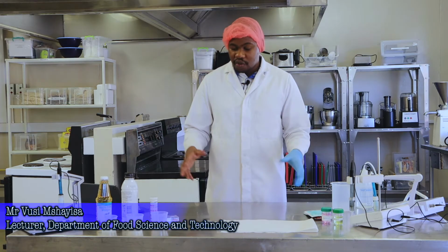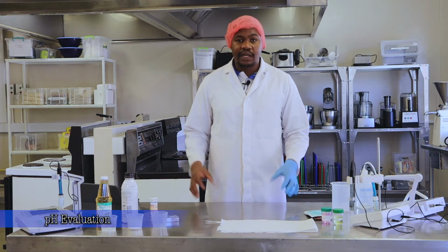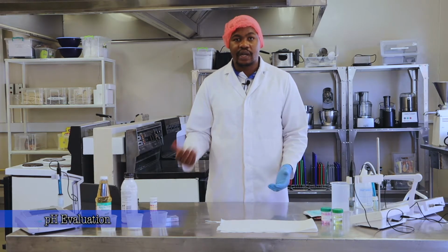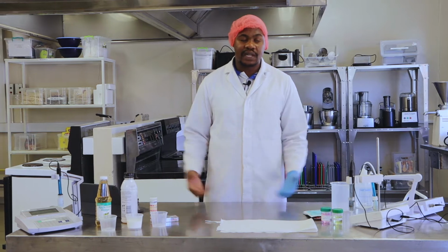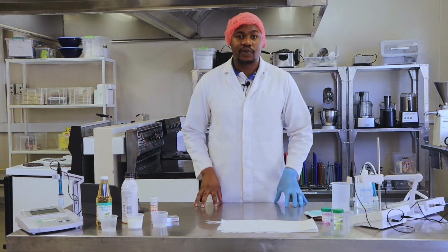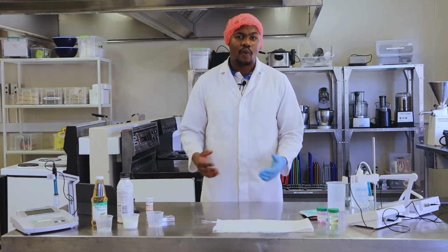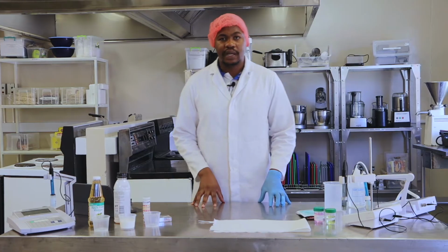Today's practical demonstration is about pH. What is pH? In layman's terms, pH is basically measuring the acidity or the alkalinity of a food substance or of a material. In the food industry, we measure pH in most cases. Why do we have to measure pH?